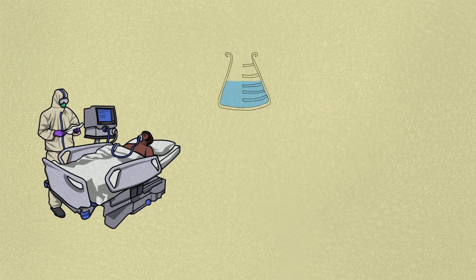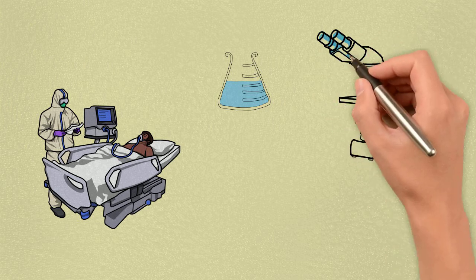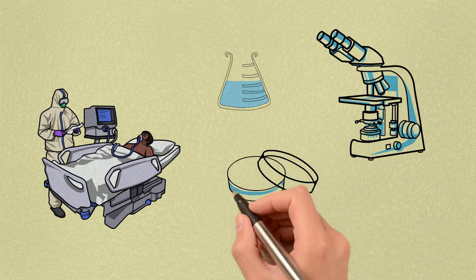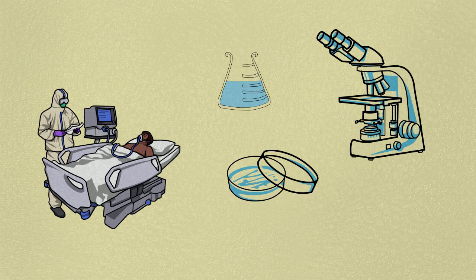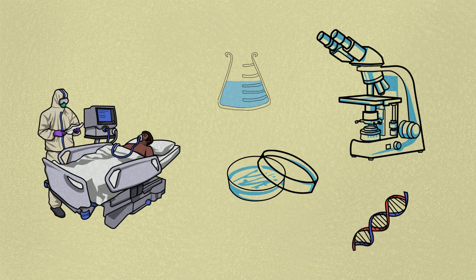Some organisms are gram-variable, meaning they may stain either negative or positive. Some are not stained with either dye used in the gram technique and are not seen. In a modern environmental or molecular microbiology lab, most identification is done using genetic sequences and other molecular techniques, which are far more specific and informative than differential staining.